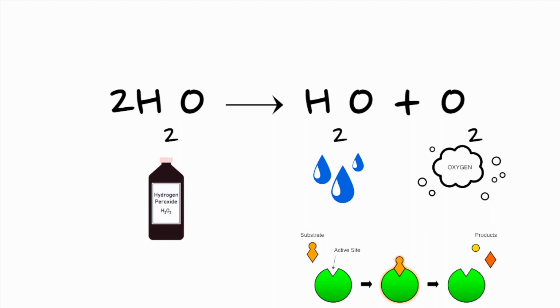And in the products, the water doesn't really affect the experiment, besides its being combined with the hydrogen peroxide. However, when oxygen, the other product, is released, it forms bubbles, and some of those bubbles get caught in the filter paper. When enough does, the filter paper rises to the top.